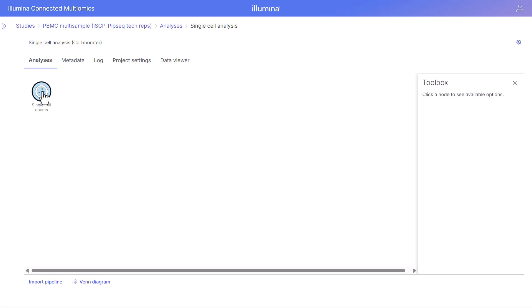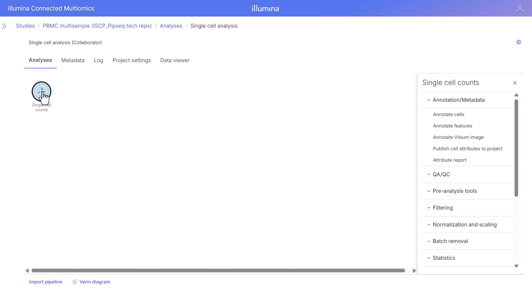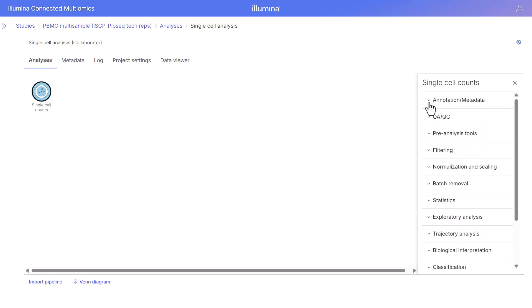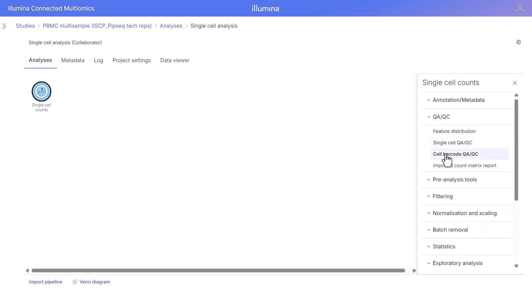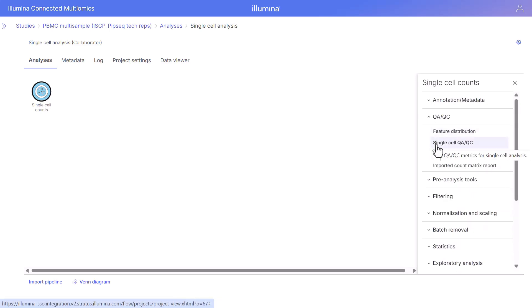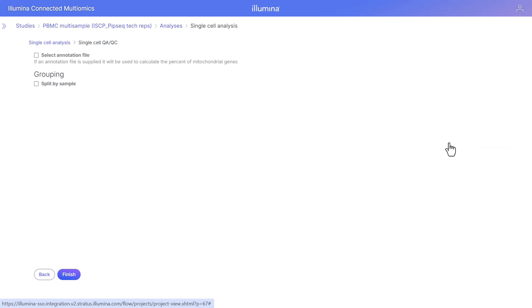There are 56,567 cells and 40,371 features, as well as the size of the data. We can click on the single cell counts node, go to the context-sensitive toolbox on the right, open our first task, which is the single cell QA/QC task, to determine the QA/QC metrics for single cell analysis. To run this task, click single cell QA/QC.